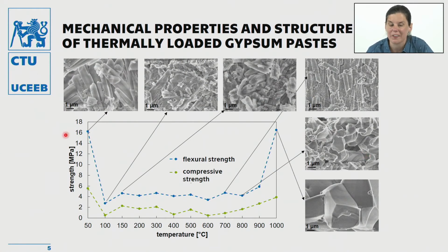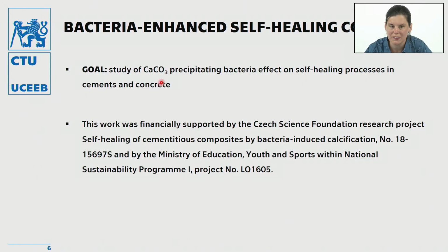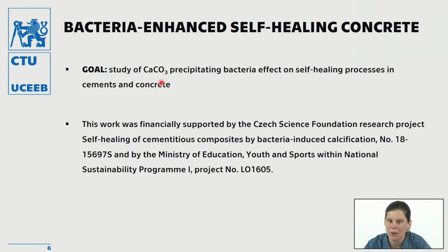Yeah, these are the secondary images which give us information about the topography, what the sample looks like. So this was one of the examples. Another one is a project carried out by Zdeněk Prošek, a colleague of mine, who investigates the self-healing properties of concrete.